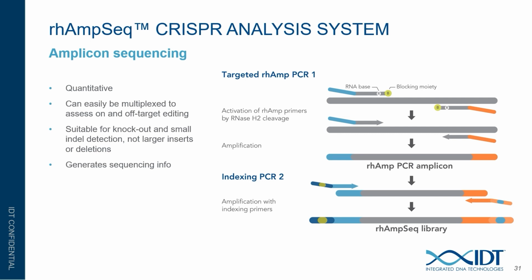unintended sites. When the RNA base in the primer binds with a complementary DNA base at the target site, the enzyme RNase H2 will cleave the end blocker from the primer end, allowing for amplifications of the DNA. This produces a much more specific, targeted PCR amplification.